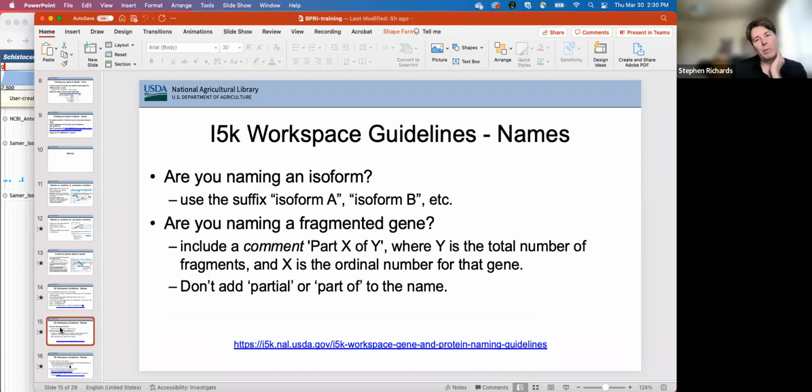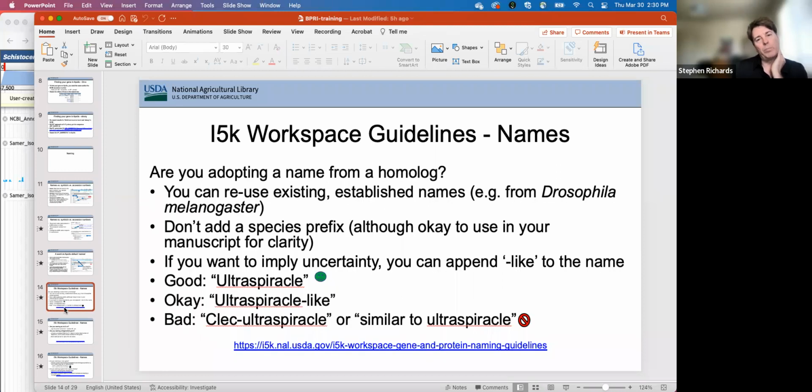What do you recommend for a paralog if we find there's 3 genes in a locus and only 2 elsewhere? That's hard. If it's a gene family with an existing naming convention, follow those naming conventions, and I can point you to some of the documents that are available for that. I don't know if this group is doing cytochrome P450s, but we could talk to David Nelson or others about that.